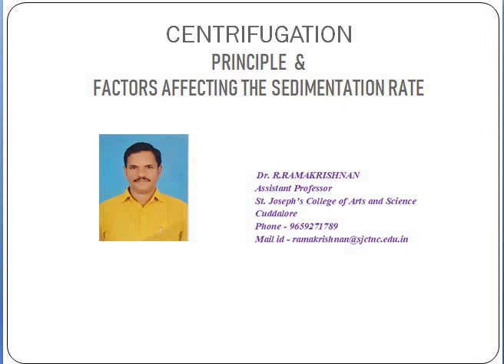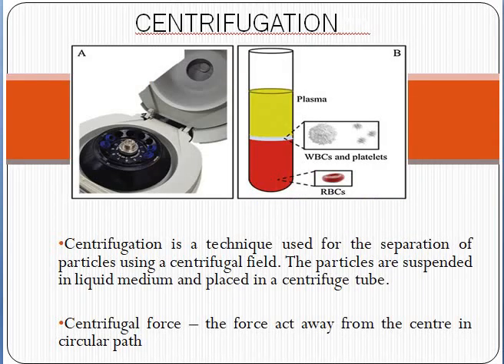In today's program, I am going to discuss the basic principle involved in centrifugation and the factors which govern the rate of sedimentation during centrifugation. Centrifugation is the separation technique used to separate the particles present in a mixture by using an applied centrifugal field. In this case, the compound to be separated should be in a liquid medium.